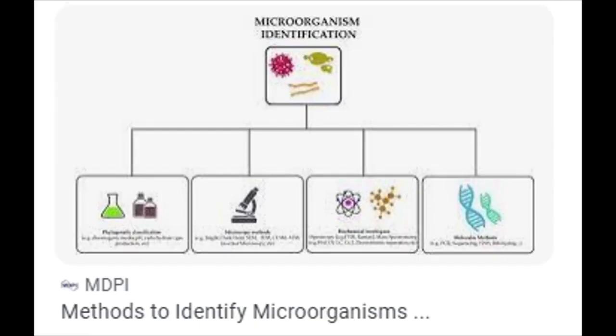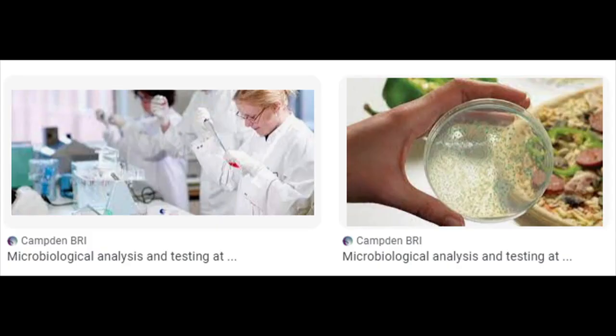What you see inside, if the microorganisms are darting and moving up and down, and you see that the shape of these microorganisms is the shape of cholera, these are the organisms that cause cholera, Vibrio cholerae. But that is not the final examination. That's why it's called direct examination. You just look at it.